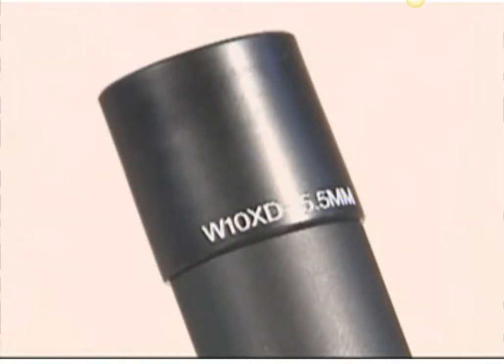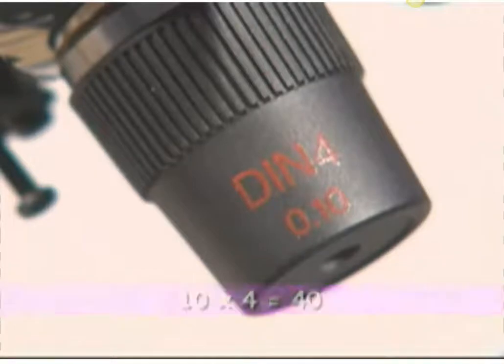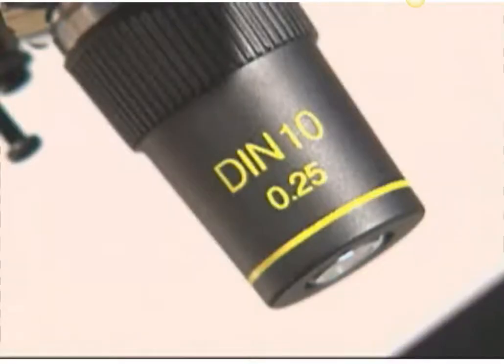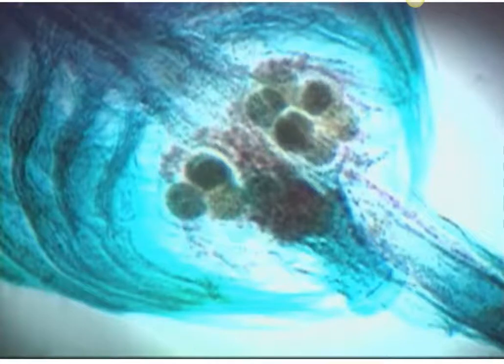When you combine a 10-power eyepiece with a 4-power objective, the overall power or magnification becomes 40. This is a brine shrimp magnified 40 times. At this power, you can get an overall view of an object. When you combine a 10-power eyepiece with a 10-power objective, the overall magnification becomes 100. This is the brine shrimp magnified 100 times. Now we can see details we weren't able to see before. These are its eggs.